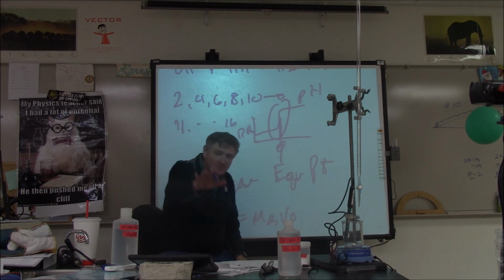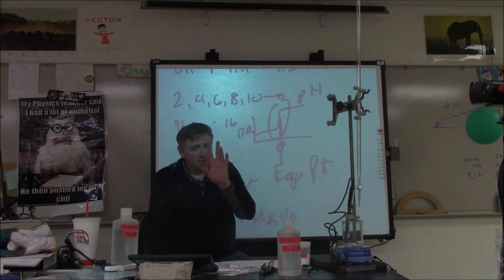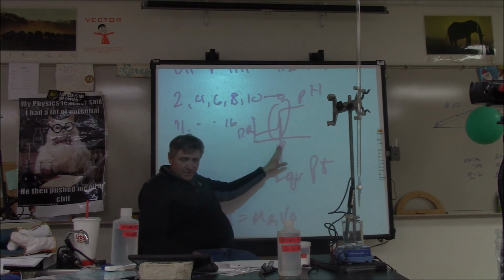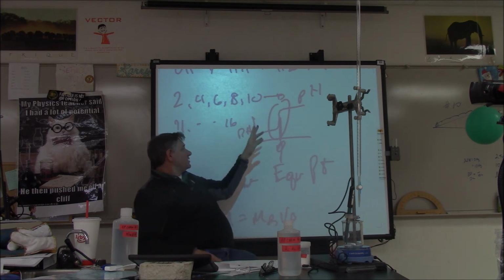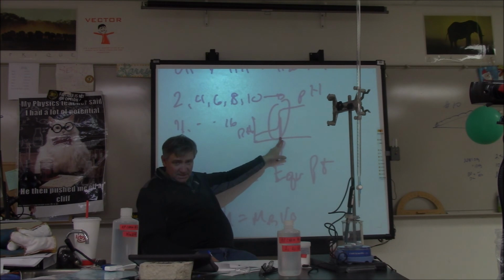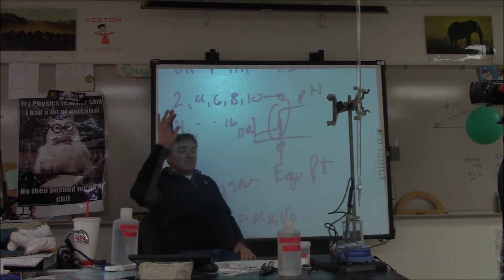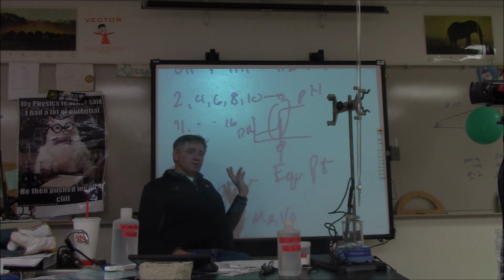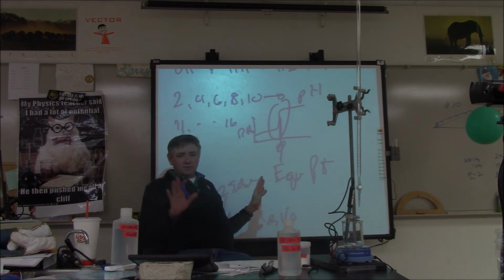Now, my Thursday group, this is what I want you to get done. I want you to do 2 trials with the KHP, and then 1 trial with this. My Friday group, you're going to do the 3rd trial with the KHP, and then you're going to do 2 trials with the acetic acid. My Thursday group, if you have time, you could go ahead and do your own 3rd trial with the KHP and have that knocked out. If not, don't worry about it.